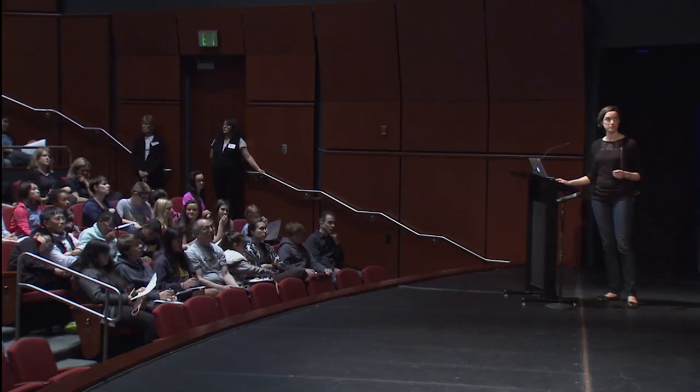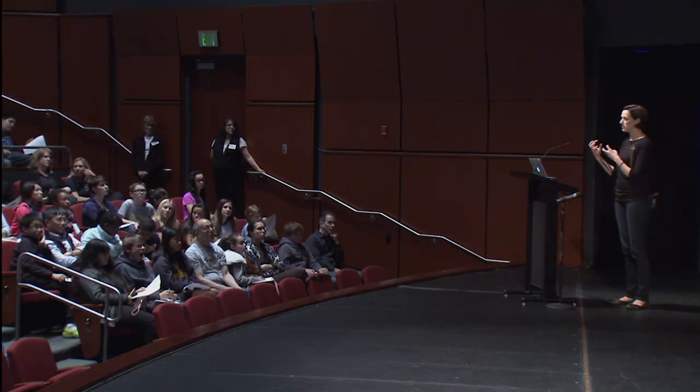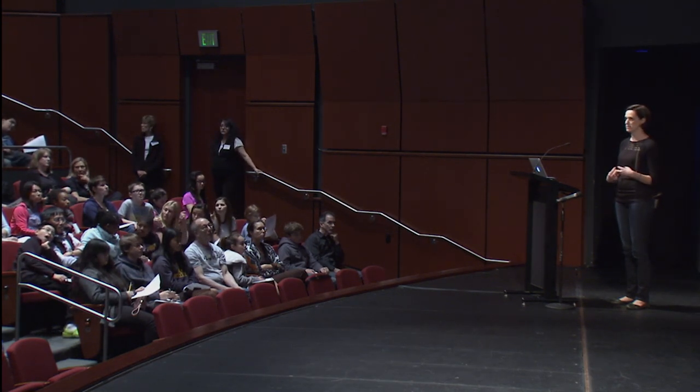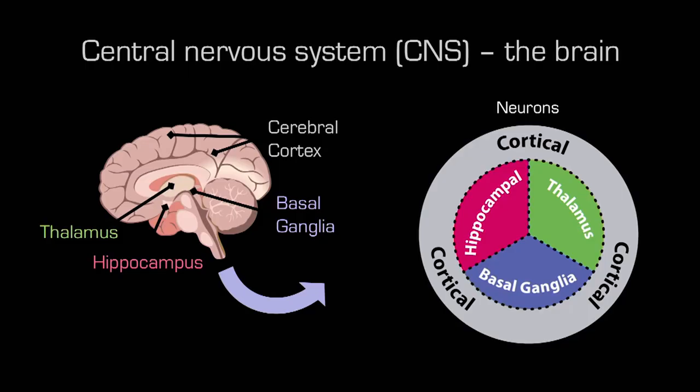So similarly, with the brain, we have a device where we could take a few different types of cells from different regions of the brain and put them onto our platform. And it's a similar device to what Heather was describing. You'll see it's kind of different shape and size. But this is the layout of the device, and it's kind of neat because if you look at the shape, it's kind of this Mercedes pattern in the middle with a ring around the outside. We can put 4 different cell types. And if you look at it, every individual cell type is able to contact the other 3 cell types.